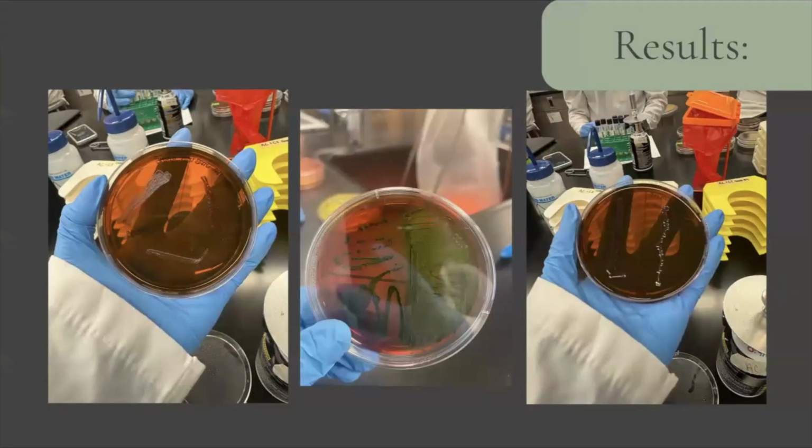For the EMB agar plates, E. coli, we saw a dark colony that was purplish on this side right here. It should have been green. This is wrong. This was due to the agar plate not being heated long enough. So this was human error.